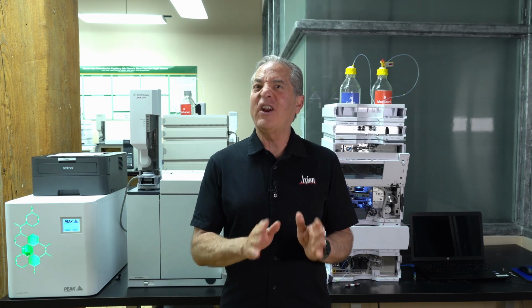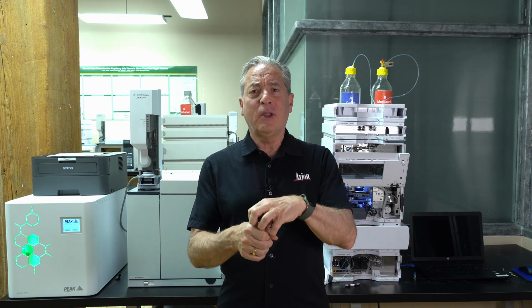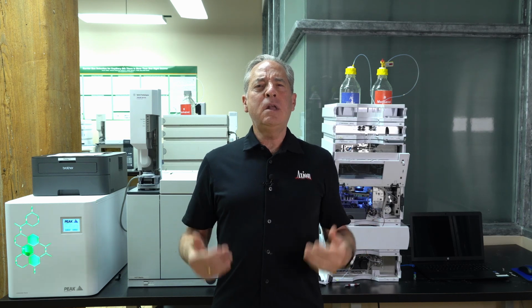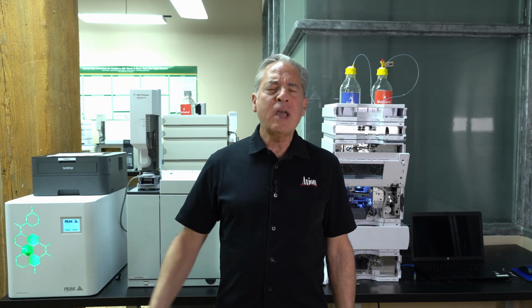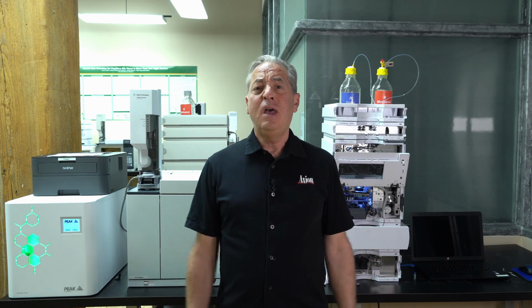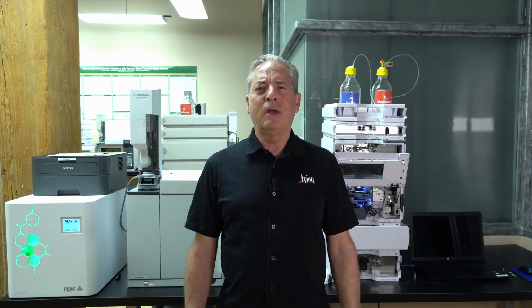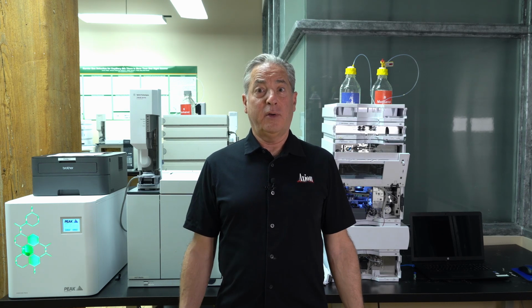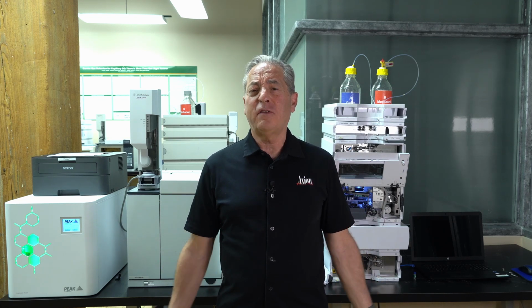Well, maybe not forever, but they're going to last a lot longer, because one of the major reasons columns die is because particulates accumulate on the head of the column. Those particulates come from the sample. So as a minimum in HPLC, I say filter the sample. When I run Coca-Cola samples or coffee samples, I simply filter them through a syringe filter and inject them directly on the LC. People ask, aren't you worried about the contaminants hurting the column? But think about this. Everything in coffee, everything in Coca-Cola is water soluble. How do I know that? Because it's in water. In HPLC, water soluble stuff just comes right off at the beginning.